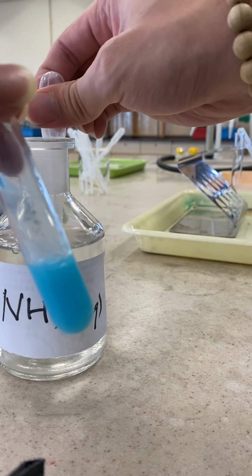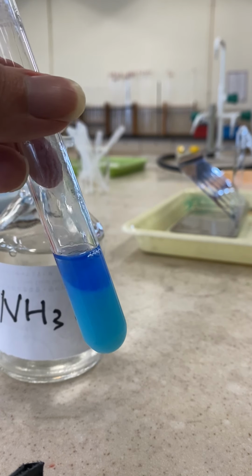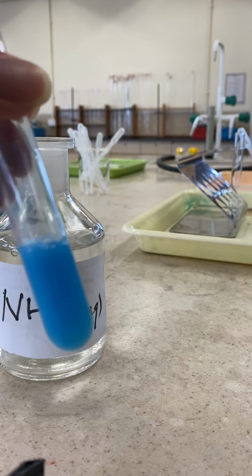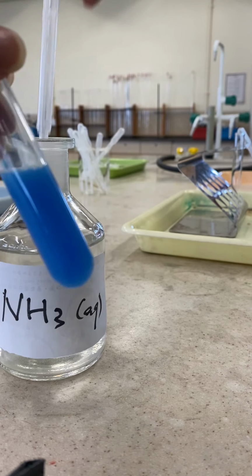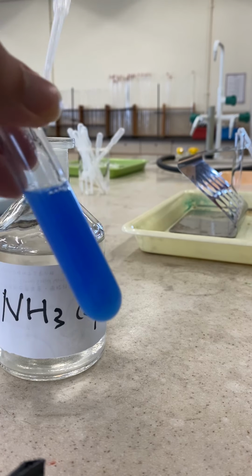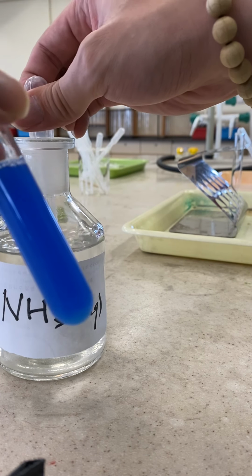I think you can see something already. Can you see? Some deep blue color develops. And when I shake it a little bit, it becomes milky. And maybe I add some more. You can see that those pale blue solids start to disappear.